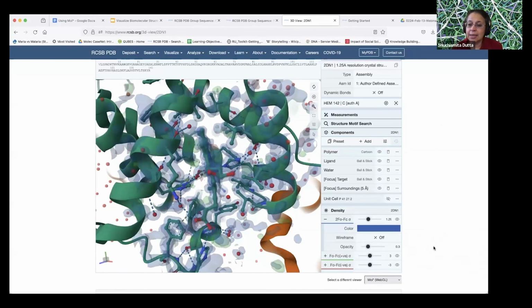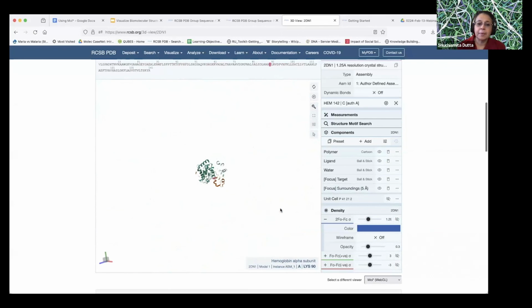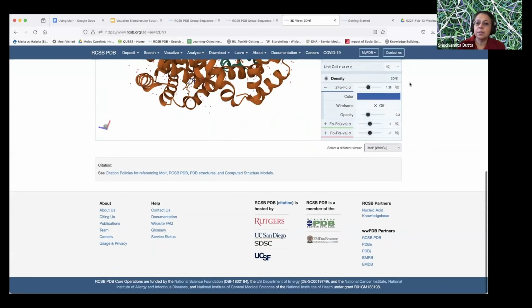So I see in the chat one more question. This is probably going to be my last question, about animation. So animation is something that is possible if, let's say I hide this. And there are options over here to create animations.